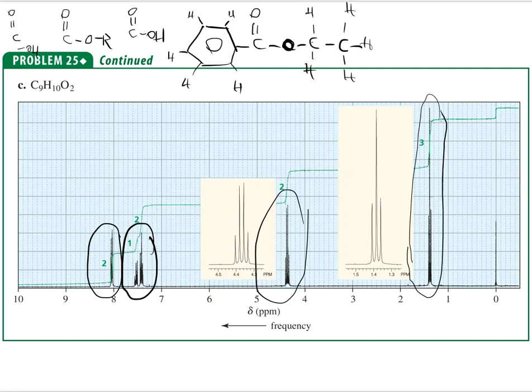So chemical composition-wise, looks pretty good at this point. At least it makes sense from what they just give me straight up as C9H10O2. All right, next up, would this match the signals that I'm seeing here? 5 different chemical shifts, possibly, and then the splitting that they're showing me and enlarging on me.